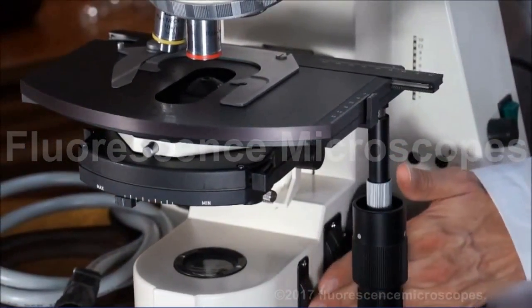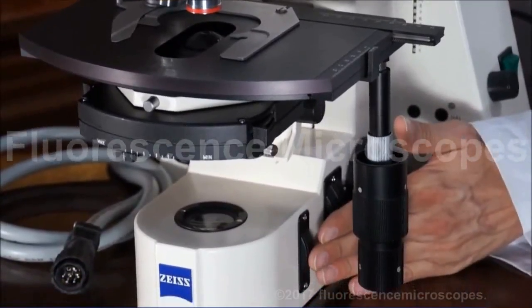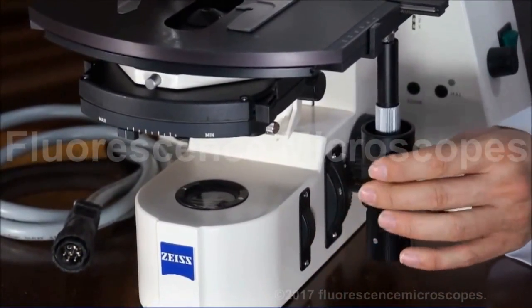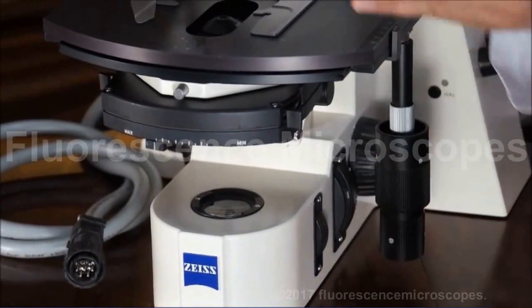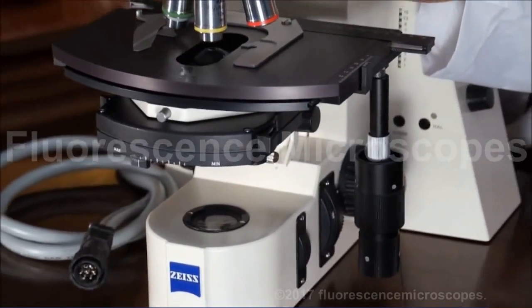Here's a luminous field diaphragm opening. This is what you're going to want to set for Kohler illumination. You're going to want to close this down and turn it to about a 10 power objective.